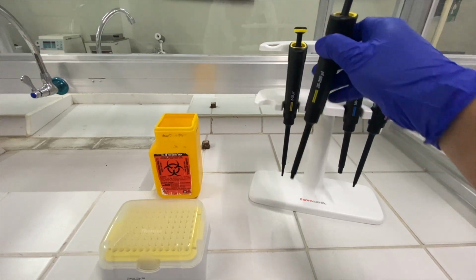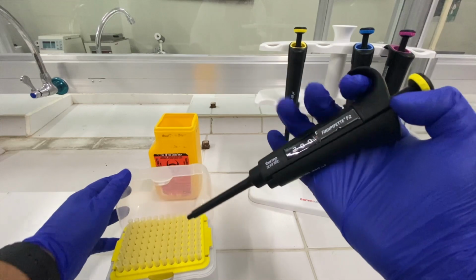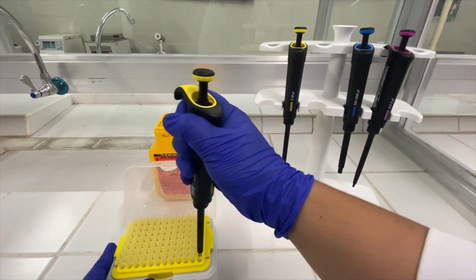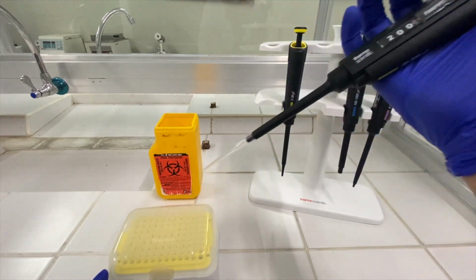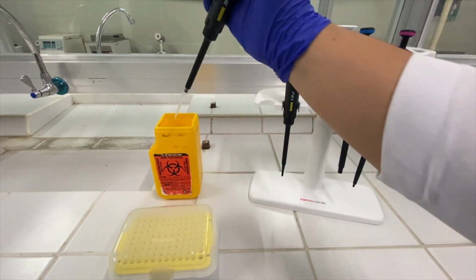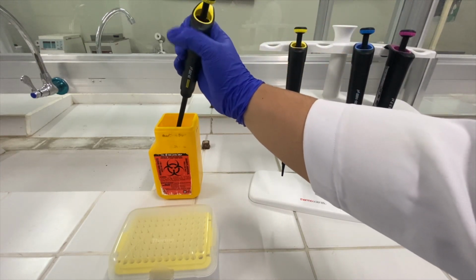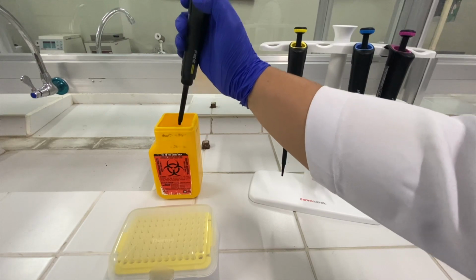To insert the pipette tip to the micropipette, just gently insert the end of the shaft onto the pipette tip and push it down lightly. Do not touch nor assist it with your hands. Now to remove it, just press the ejector button and discard the tip into an appropriate infectious waste.